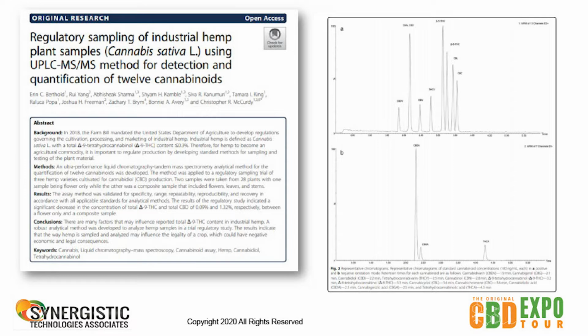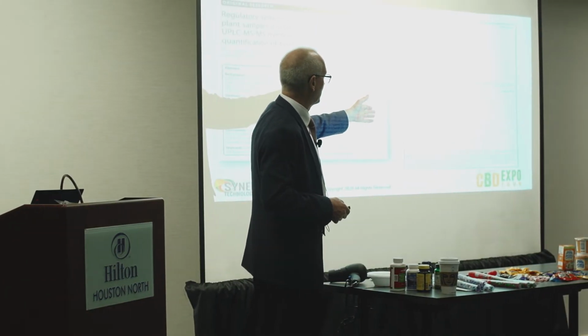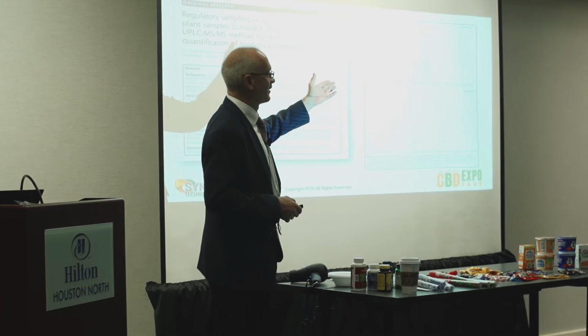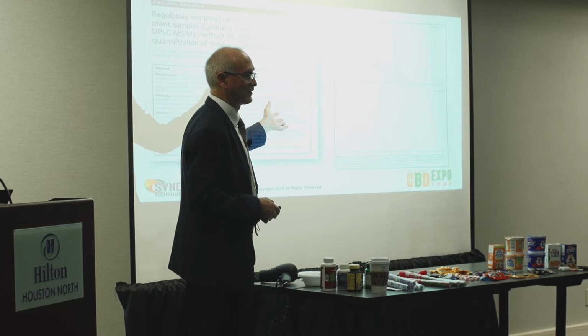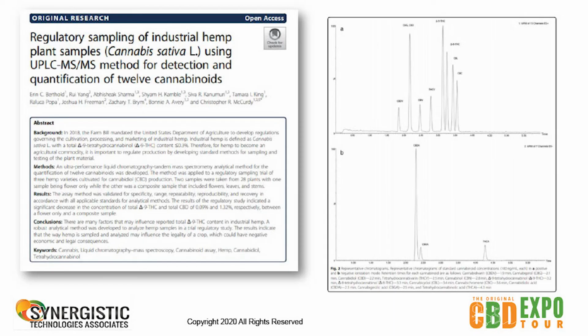And within this process, this is a system that would be a little too expensive for your first run, but as you're looking at the chromatograms and the different things that you can see, you can tell that even running through the standards, that's where you have your known concentration of compounds. You walk through the standards, and then you run a sample, and you can see that not all those peaks are coming out at the same time. And we'll talk a little bit about this chromatography and how you get to these things. But this is the overall process of something we're trying to get to, and then we'll show step by step what this means and why it's pertinent.